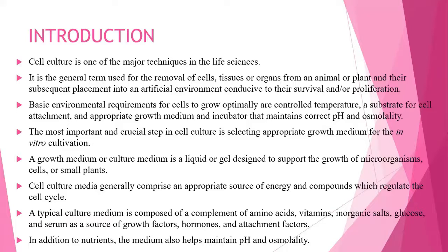For growing, the cells require optimal temperature conditions, and also the required pH and humidity in the incubator. The normal incubators that we use to culture microbial cells are 37-degree incubators, and here again 37 degrees is required. Along with that, you need to maintain 5 to 10% CO2. That is very important. That is the difference between your normal incubator and a CO2 incubator. Here we have an external supply of carbon dioxide, which is required for your cells to grow efficiently.